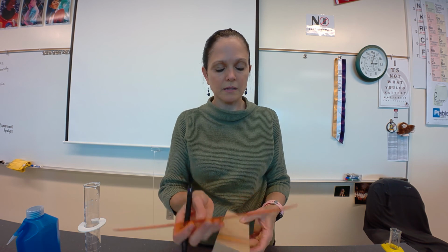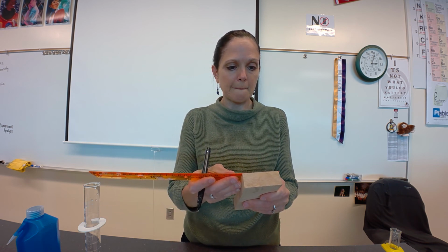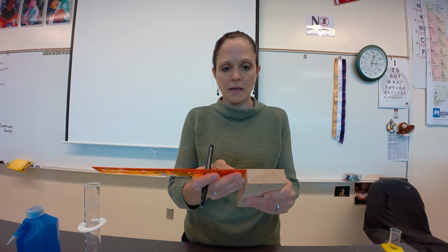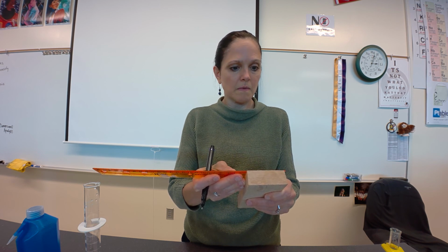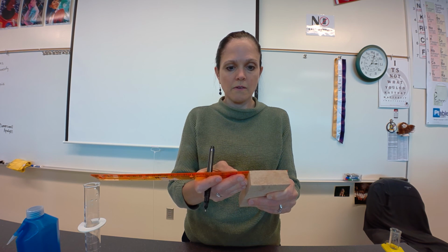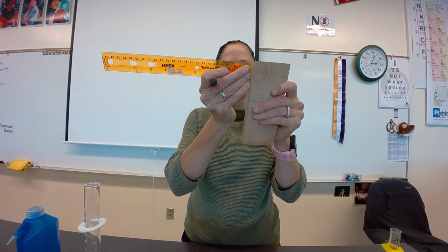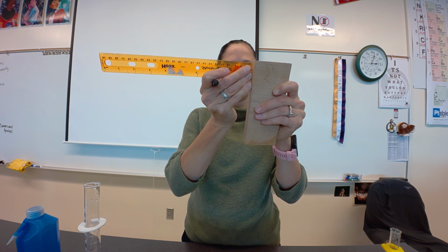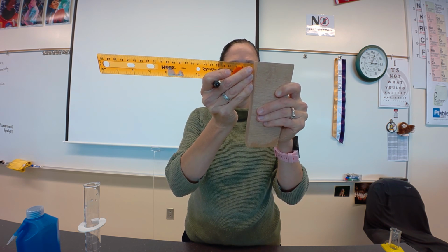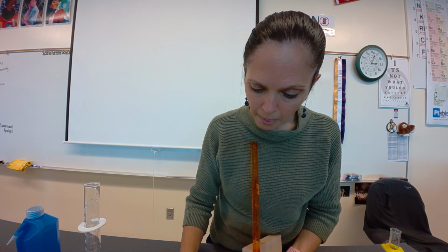My width, let's do the width. I have 5.93.